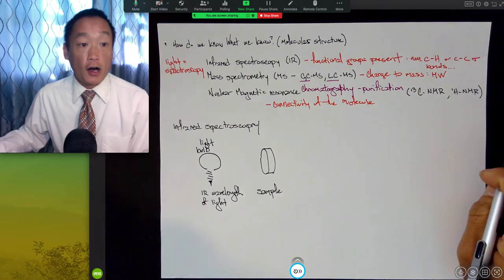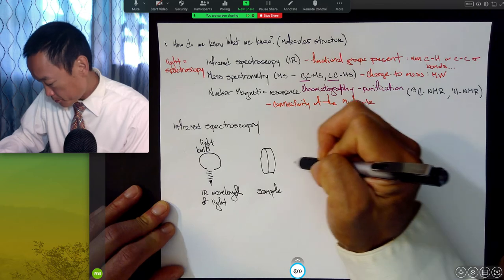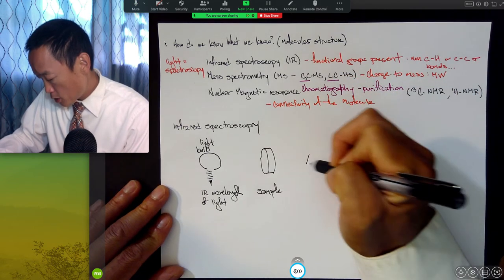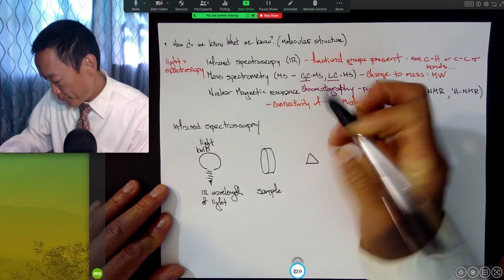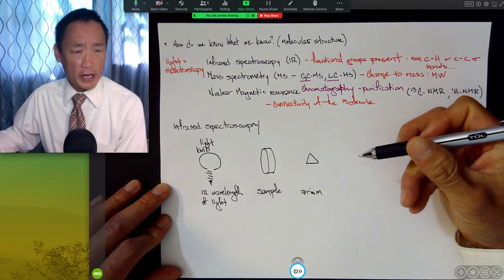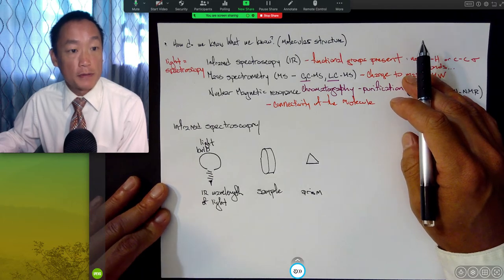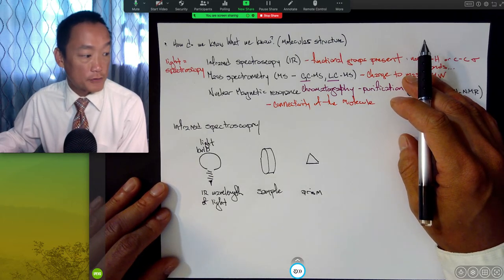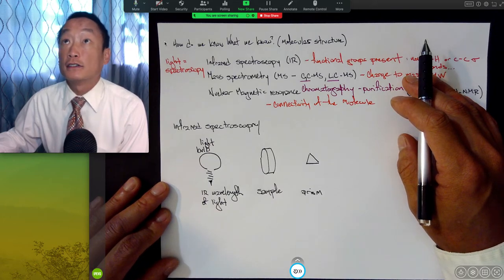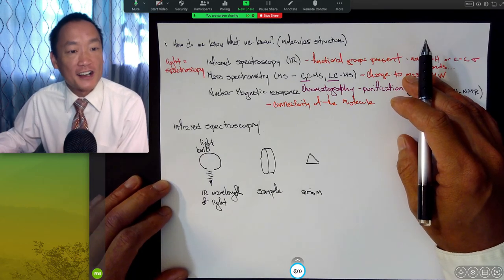Right here. And then that light travels through here to a prism. When you think about what impact a prism has, it's the impact that as a kid you probably saw: sunlight hits your prism and all of a sudden you get to see the colors of the rainbow.